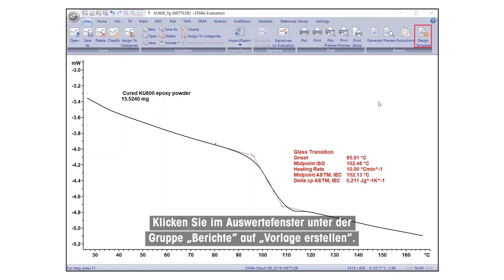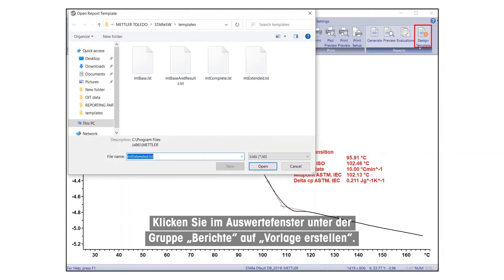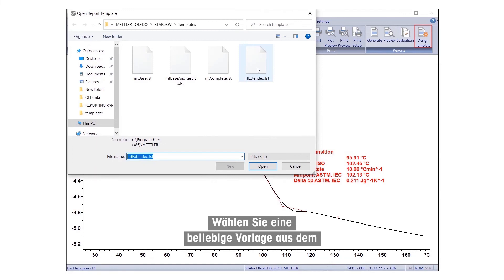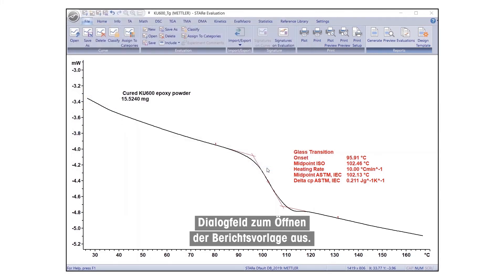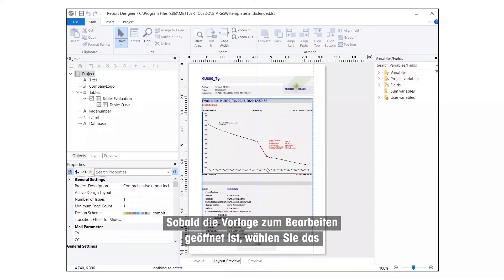In the Evaluation window, under Reports group, click on Design Template. Select any template from the Open Report Template dialog box. Once the template is open for editing, select the company logo, either in the Objects tree or in the Preview.